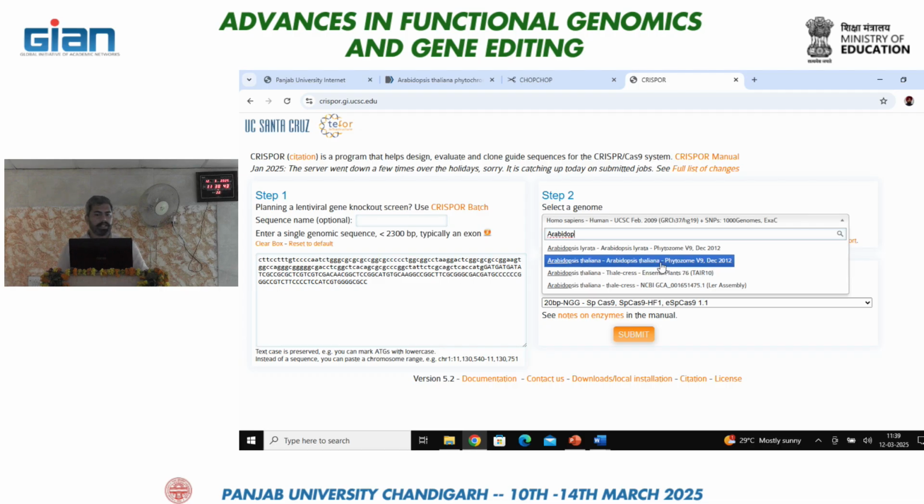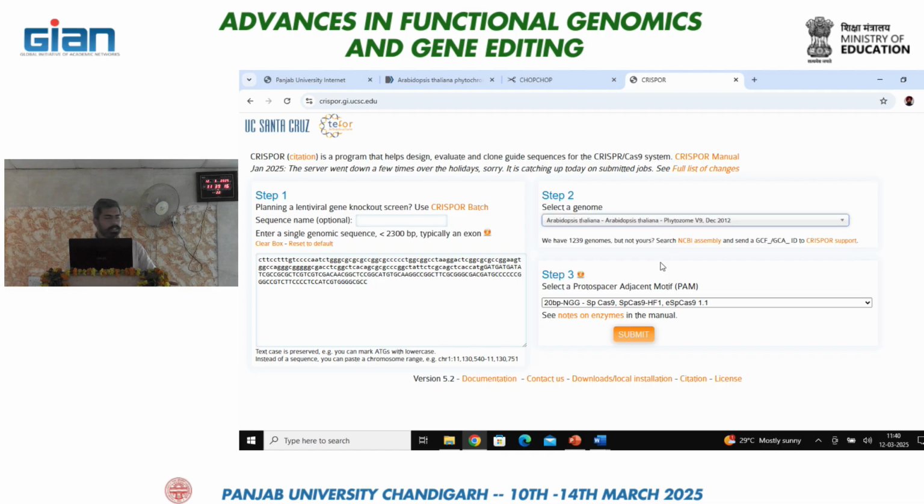So you have to take these things in mind when you are designing the target site, because if we select this, the genome assembly is very old, like it was uploaded in December 2012. With the updates, the genome assembly also changes, so we prefer to use a newer genome assembly. So you can screen out these tools. That's why I have provided you with a list of tools. That will vary according to your target organism and the available genomic version for that.